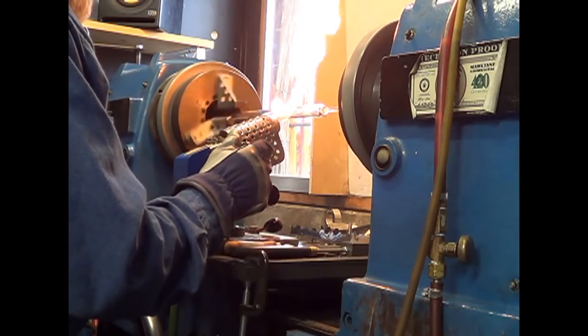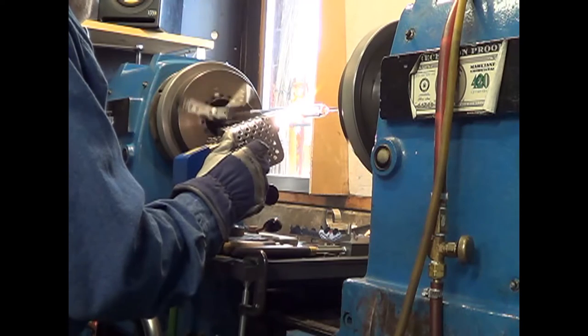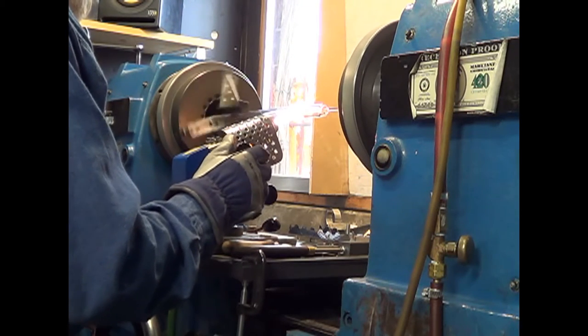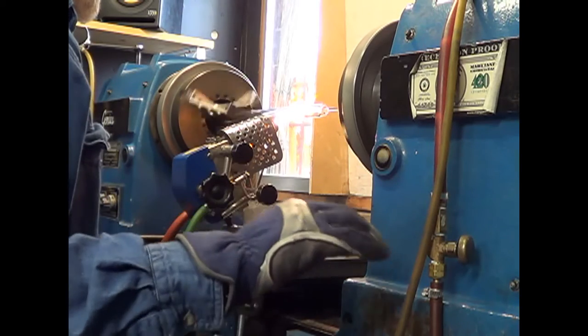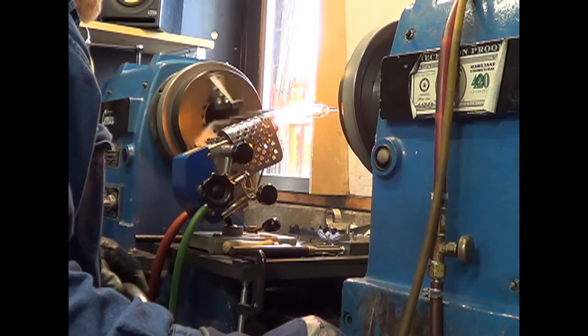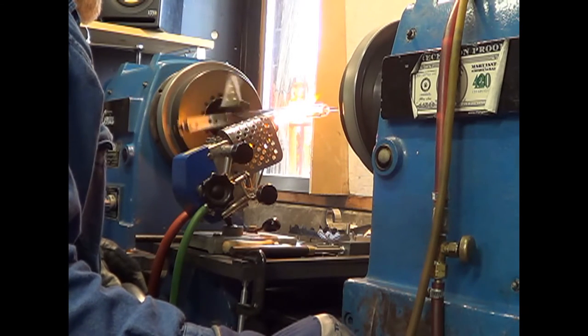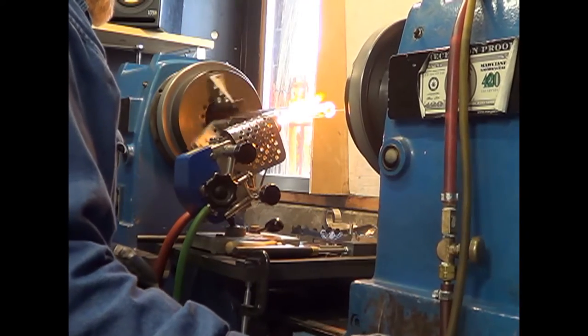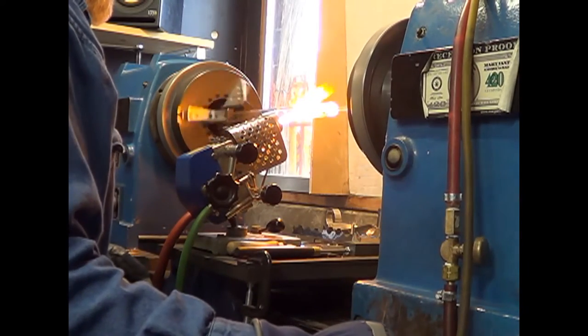So we've made our connection on the right side. Now we're heating the tube, and once we've got it hot enough, we're going to start moving the head to the right — stretching the tube — and it's going to separate by itself, right where the heat is, and it will close up.